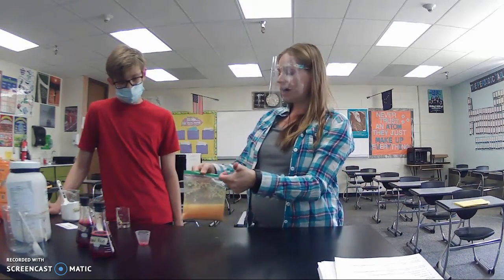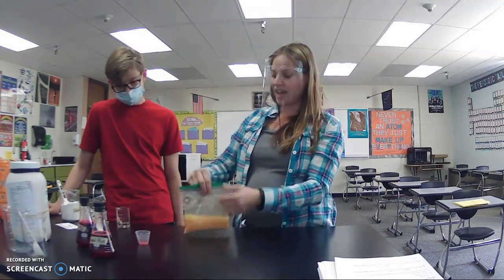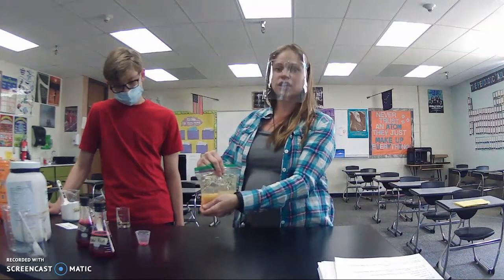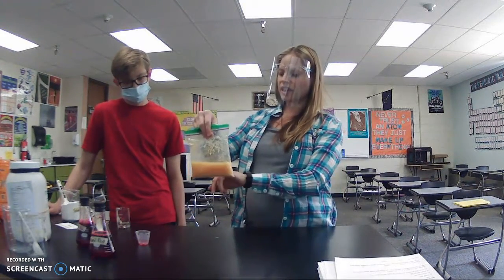So in that one, we had bubbles. We definitely had a gas produced. You can see that because the bag was inflating very quickly, and we felt a change in heat. And color. So that's indicating that, yeah, it changed pH.